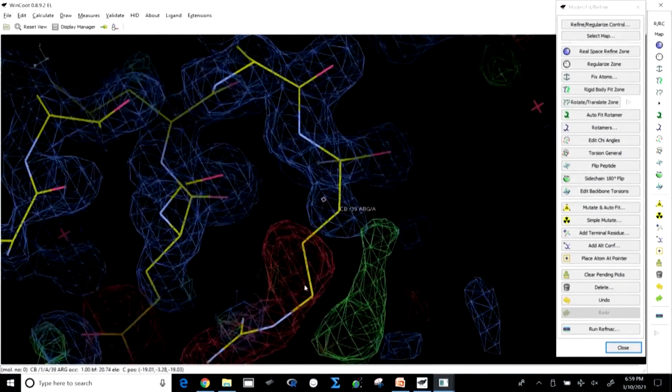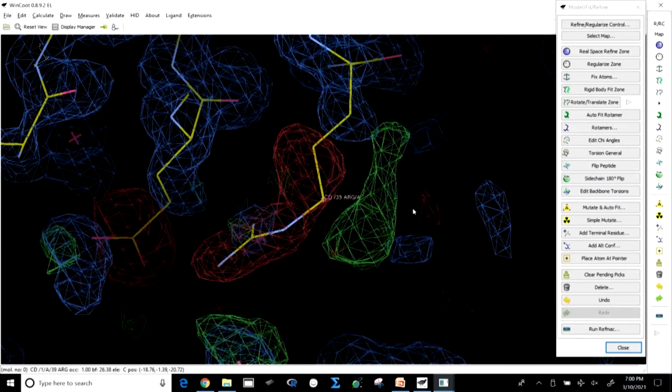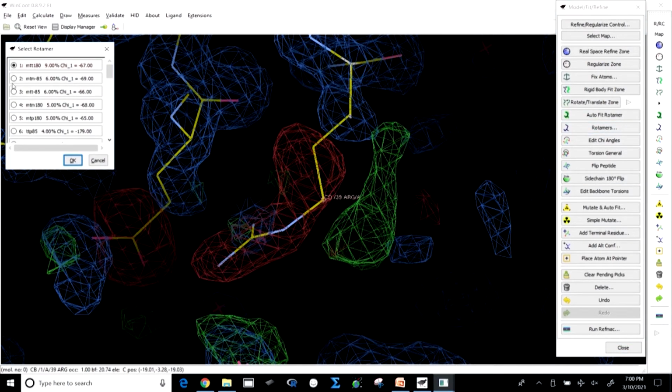So, what is the possibility? If you look here, that is the beauty of the COOT software, sitting here looking at the electron density map. Now, you could imagine yourself not only as a crystallographer, you should actually work as a crystallographer. So, see here the option is rotamer. If you click the rotamer, you get a lot of options of rotamers.